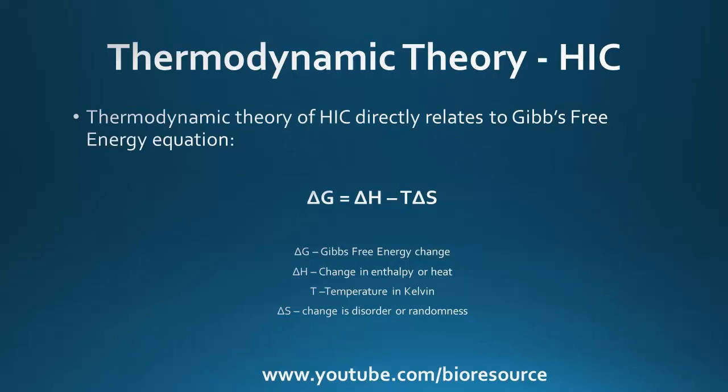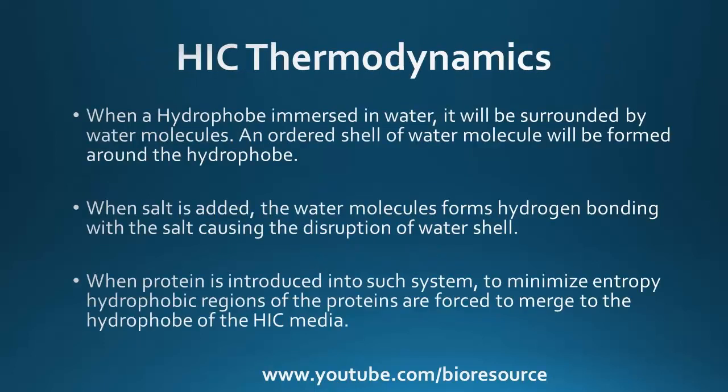Let's see the second theory on hydrophobic interaction chromatography, which is based on thermodynamics. The thermodynamic theory of hydrophobic interaction chromatography directly relates to the Gibbs free energy equation. The phenomenon of increased interaction in the presence of salting out ions is explained by a higher gain in entropy when water is transferred from the surface of a non-polar molecule to the bulk water. In hydrophobic interaction, the entropy change is of greatest importance.